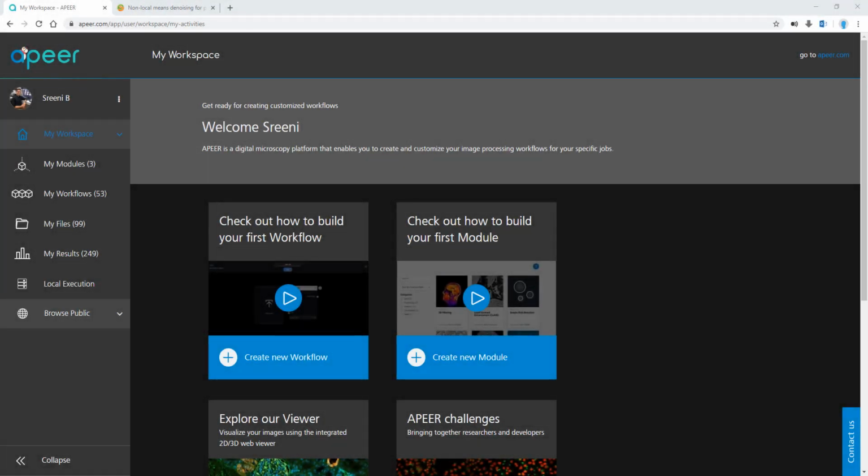This video explains the process of creating an application out of your Python code that you can run on APEER.com, which is a cloud-based image processing platform for microscopy applications. Of course, the starting point or a prerequisite is that you have a working Python code that you would like to create an application out of.